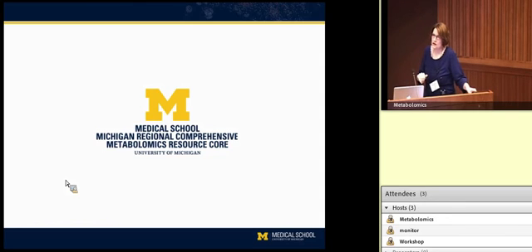So let's say I'm interested in targeted analysis as well as some known metabolites that are not included in targeted analysis. What kind of choice would I have? Talk to me about what we're seeing now in this sort of hybrid, targeted, untargeted group, and if that covers what you need, that might be the way to go. And if not, you can do the untargeted platform.